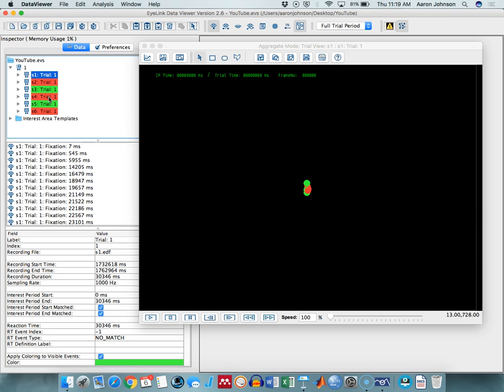Any questions? So hopefully you can see this has a lot of potential, especially when it comes to analyzing video, because now you can generate your numbers via an interest area report, but also you can get a more descriptive way of saying, okay, generally, when I'm watching the video, am I seeing patterns of behavior which then reflect through on the interest area report? And the ability to save this at any point as a video, which you can then use in talks or even in publications, is quite a useful feature.